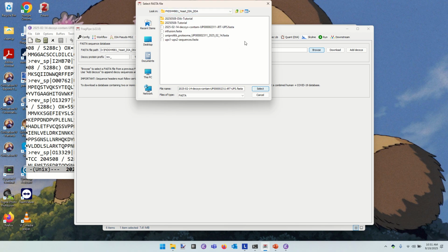Oh, gosh. My drive D. And it was in the GJM training. It was in part A. And then it was this one, the Valentine's Day database.